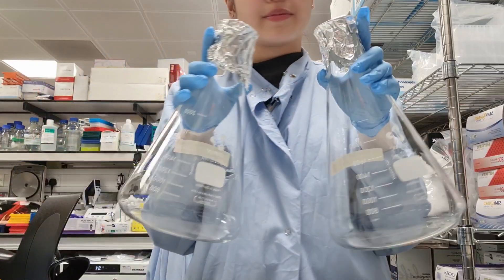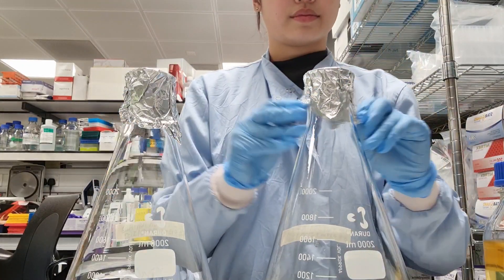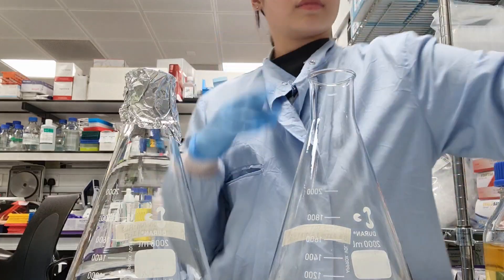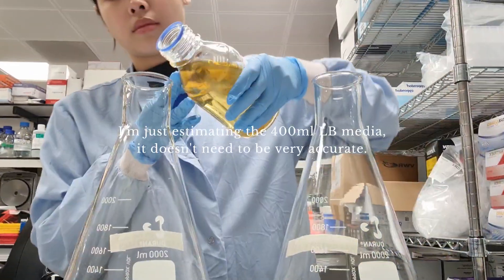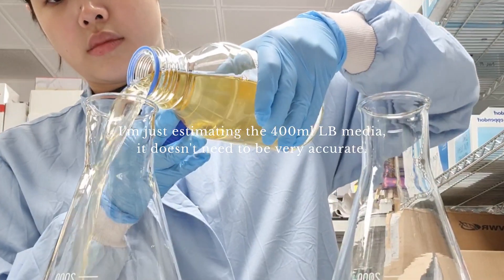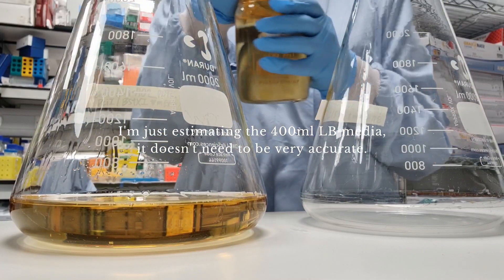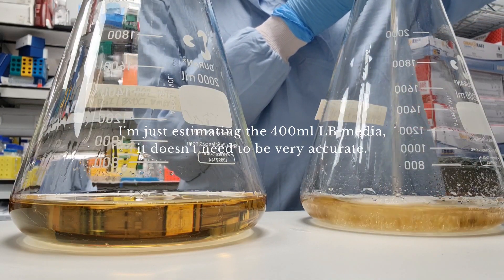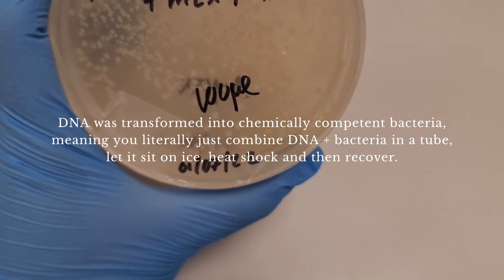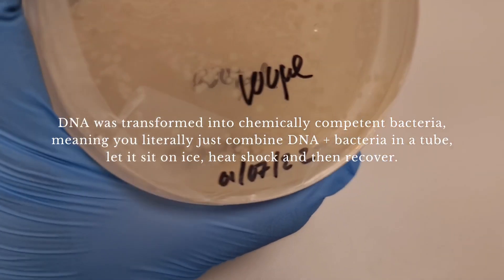So for maxi prep cultures I normally put 400ml of LB media. Here are some bacteria that I transformed on Friday. As you can see there are a ton of colonies.